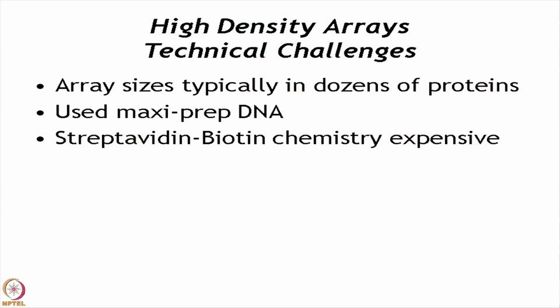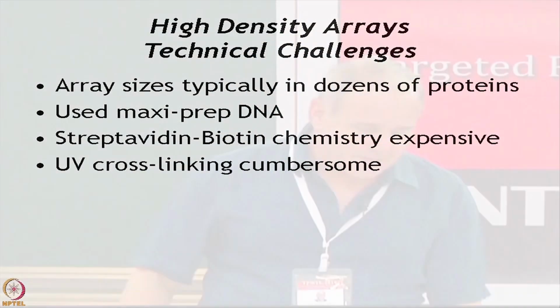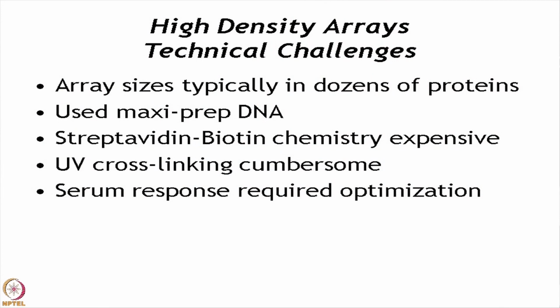We were using this streptavidin biotin chemistry to do our arrays at the beginning, and that clearly was not going to work because it's expensive and it involved having to stick them in the UV box for a while. It was really kind of a pain. The UV cross-linking part was cumbersome. And we needed to do some optimization, and we needed to increase our content.